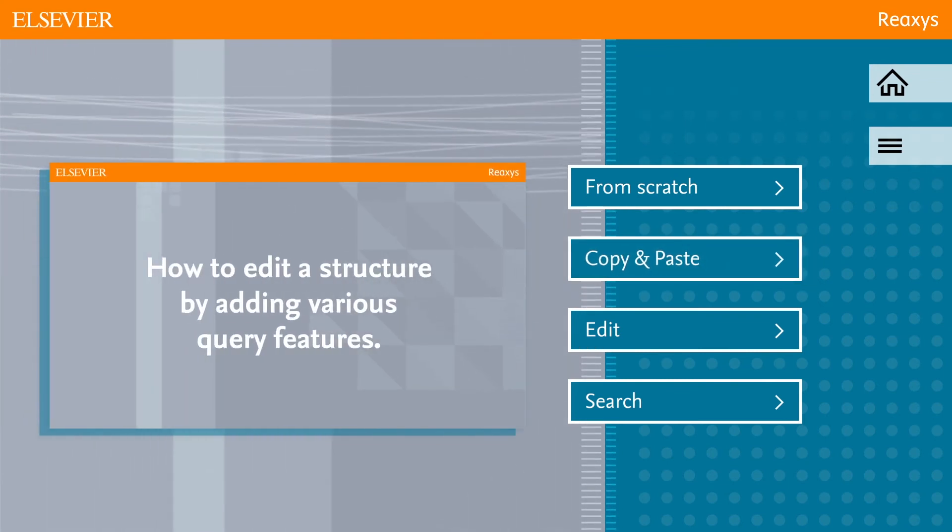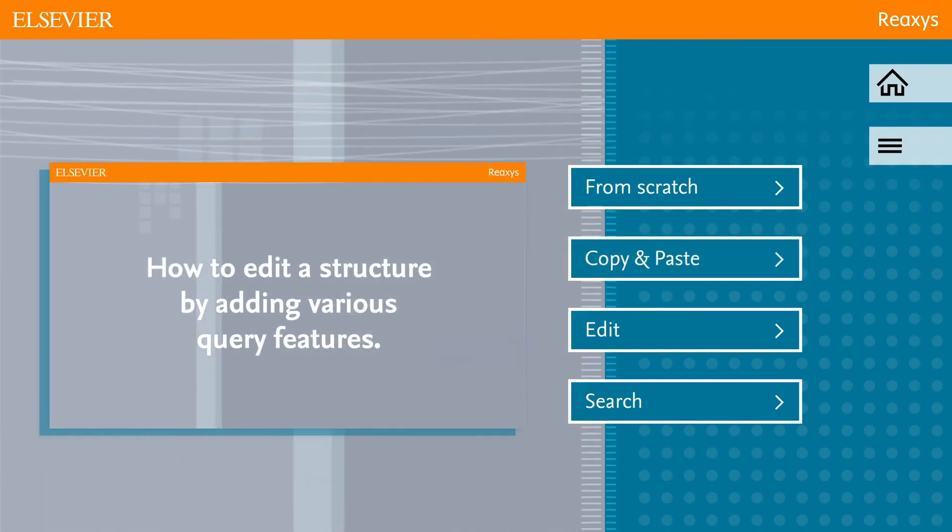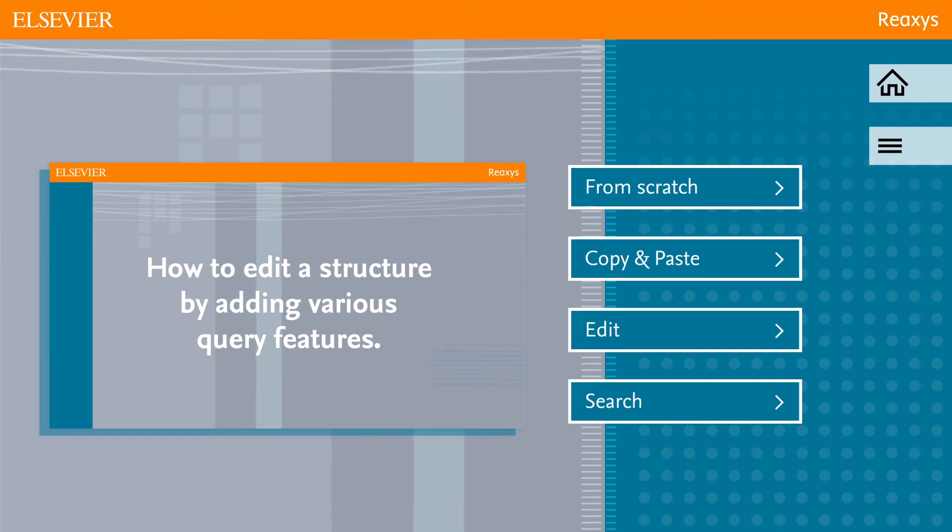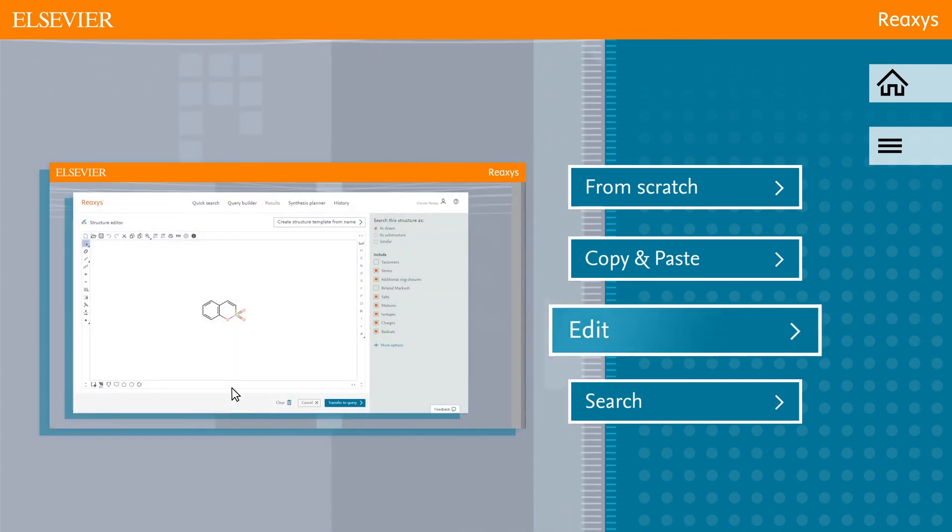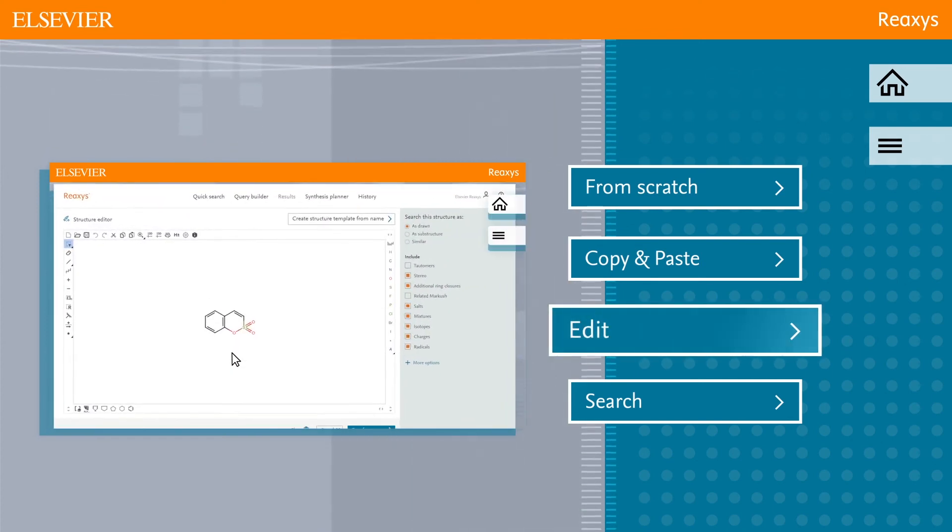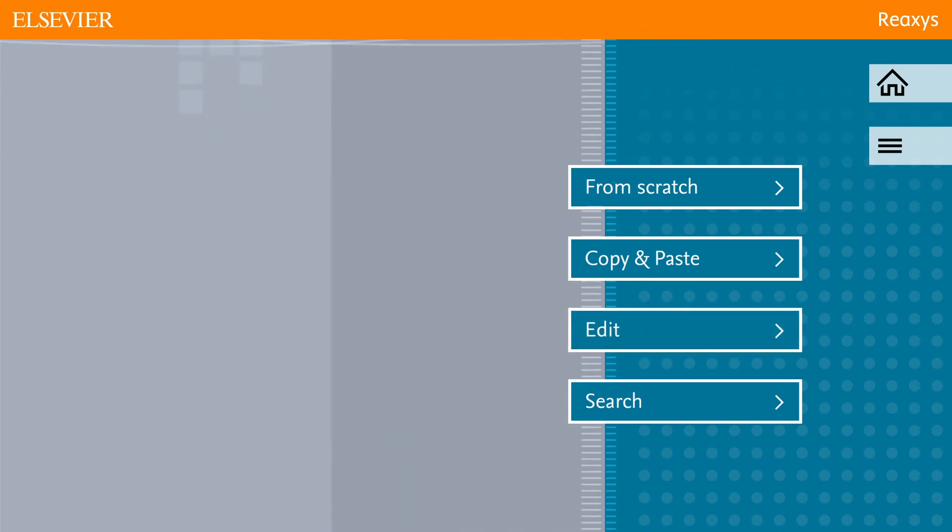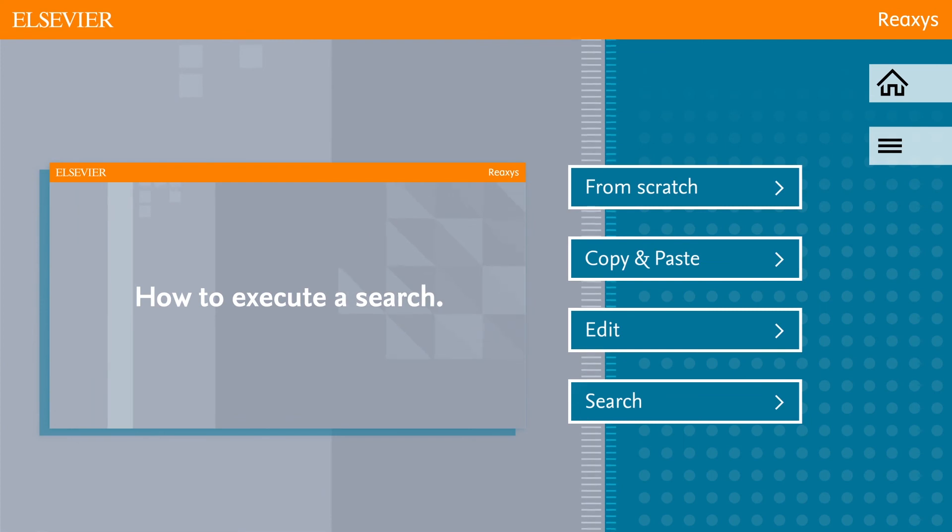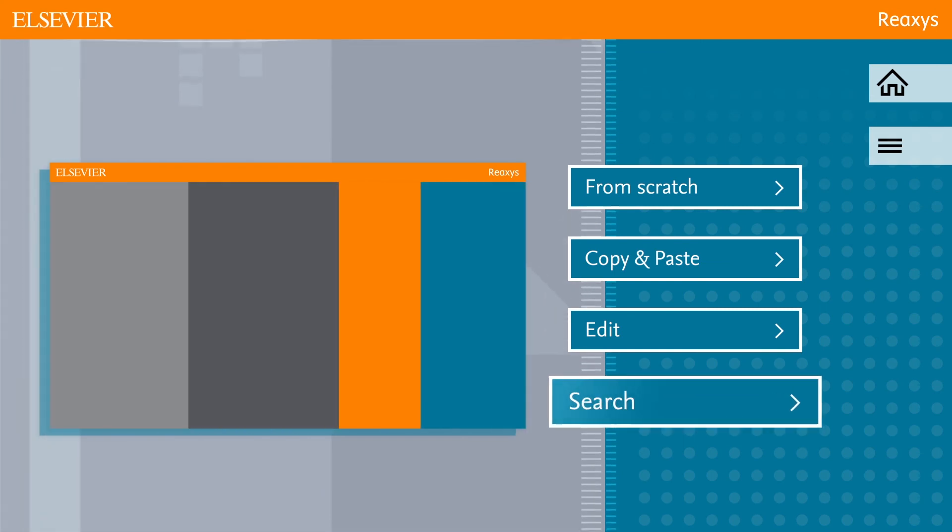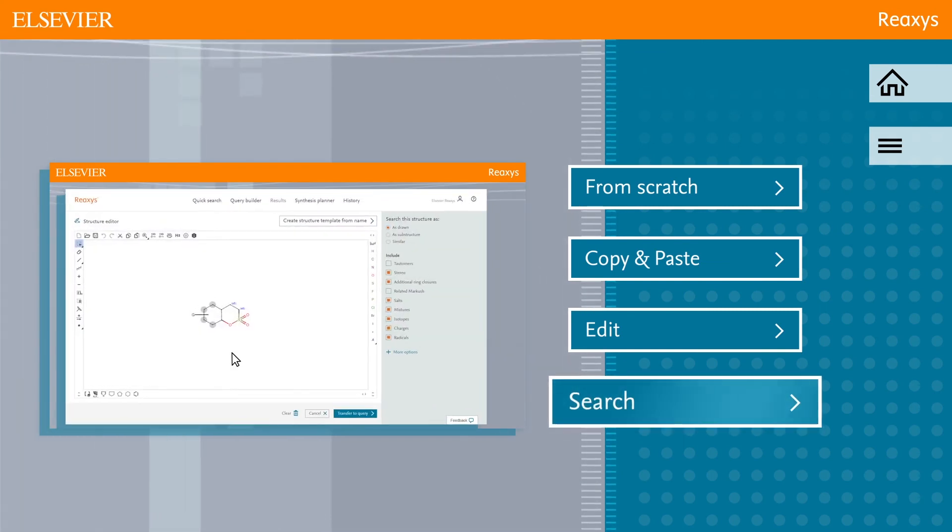Do you wish to edit a structure by adding various query features? Click Edit. Or do you want to know how you can execute a search? Click Search.